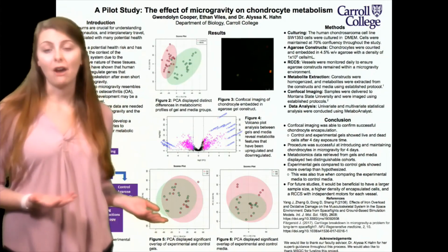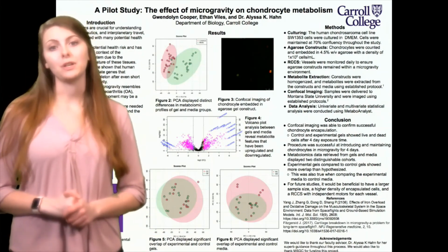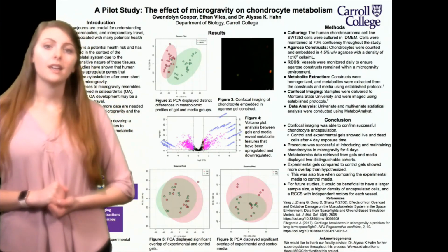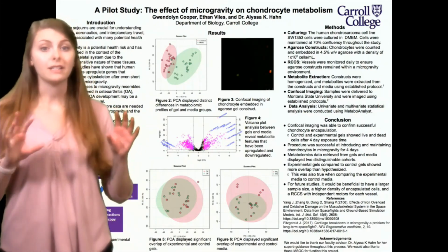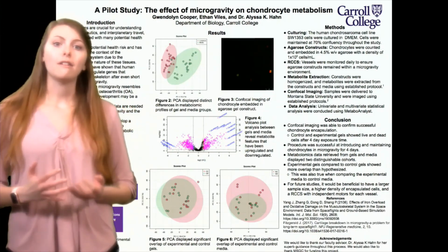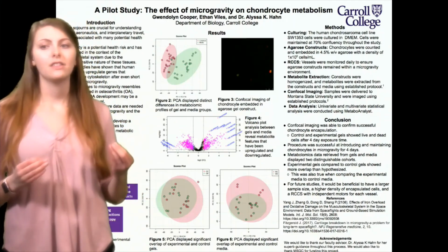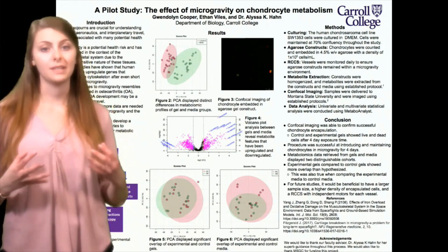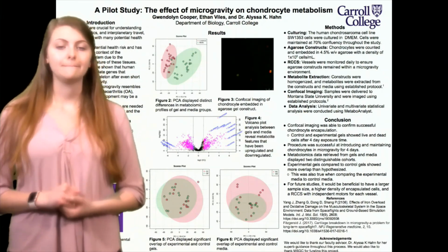It could also help account for why our metabolic shifts or responses weren't exactly what we were expecting or what we had hypothesized. And lastly, the last issue we really ran into was that our rotating cell culture system has 4 vessels that the construct and the media go into respectively, and they don't have their own independent motors, so this made it really difficult to ensure that they were all in a microgravity environment at the same time with the same speed. And so for future studies, we would recommend these alterations.